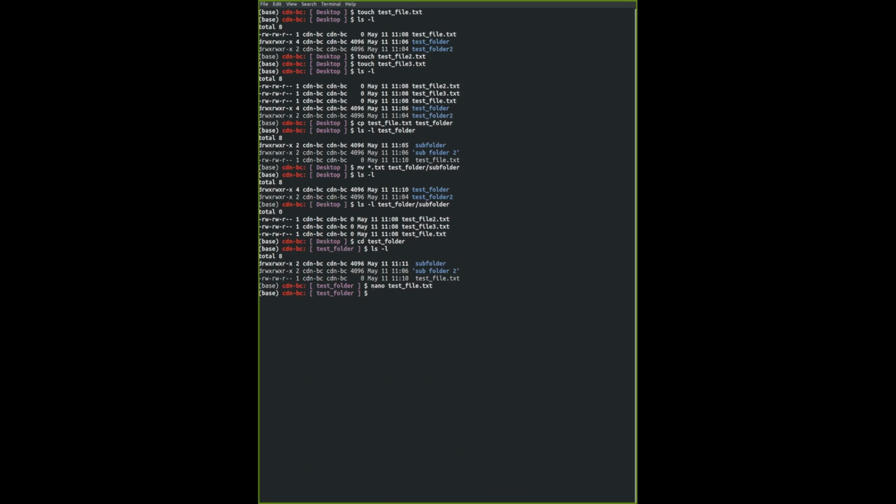Okay, I'm going to paste this set of code into the Etherpad if you want to follow through. Okay, and clear the screen to show you the next section.